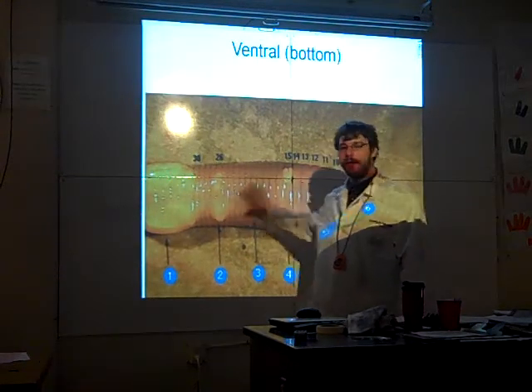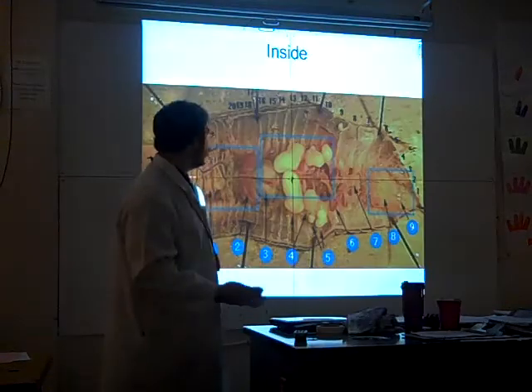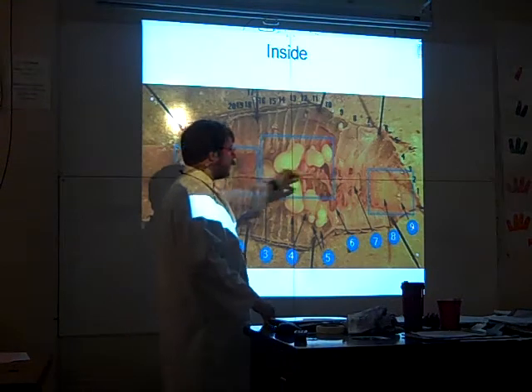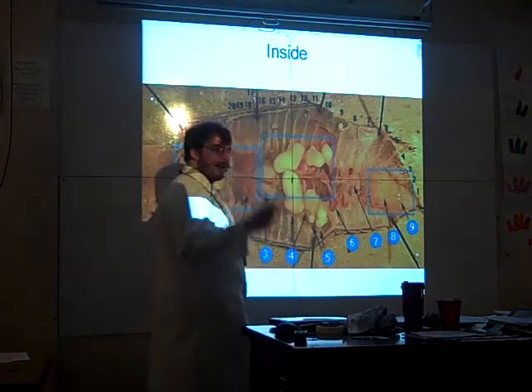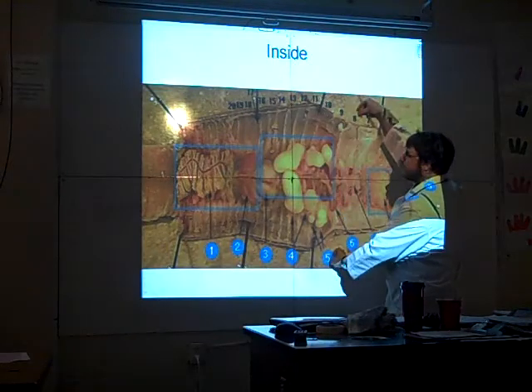So this is the ventral side, the side you're not going to cut. Again, there's the clitellum. Once you cut it, you have to do a few things. It's not going to look like this right away. You're going to have to take your scalpel, cut it open, then take the forceps. It's a two-person job. You take the forceps and pinch the skin away.